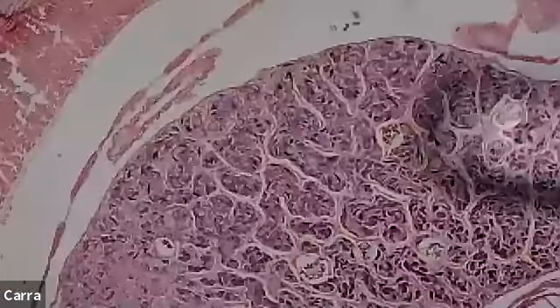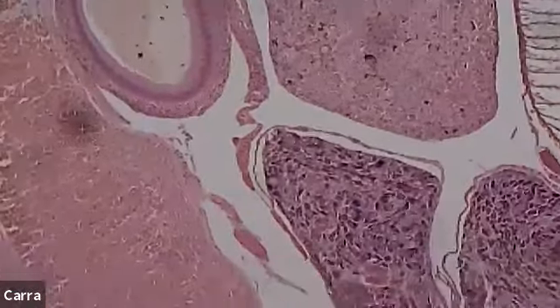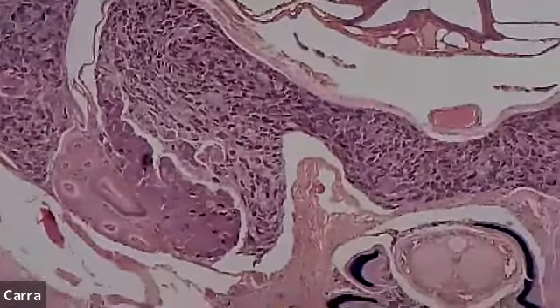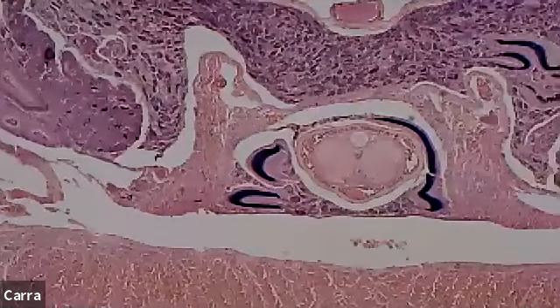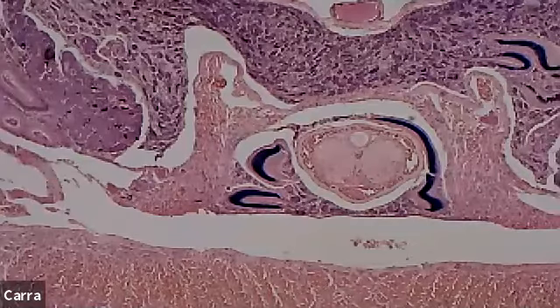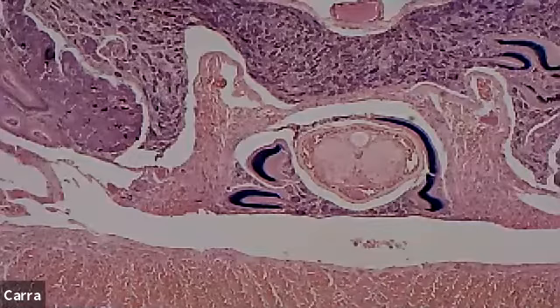All right. And so I'm not going to go into all of the different organs here because honestly, it's kind of hard to see when you can only see one piece of this at a time. But there's some really good diagrams that we provide you where you can see this entire cross section as one big whole piece. Look at the labels and see what each thing is pointing to. I think that the circle we're looking at down here is one part of the circulatory system. So it's either the circulatory system or the nerve. And I think they might be right on top of each other.